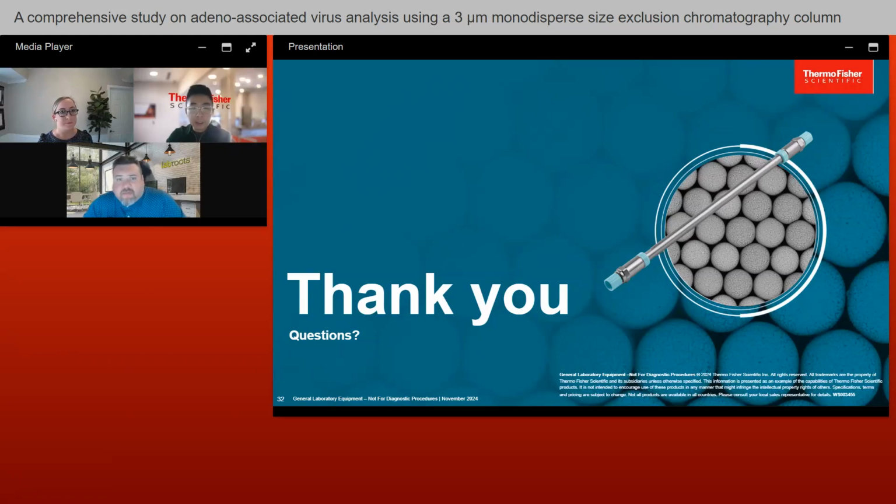I guess I will take this one. So empty and the full AAV has almost identical particle size. I think the full, with the DNA loaded, is slightly denser and slightly larger. But currently, I don't think SEC has the capability to fully or baseline resolve full and empty. You might just have them co-eluting as one peak, or sometimes maybe as a shoulder peak, slightly shorter.